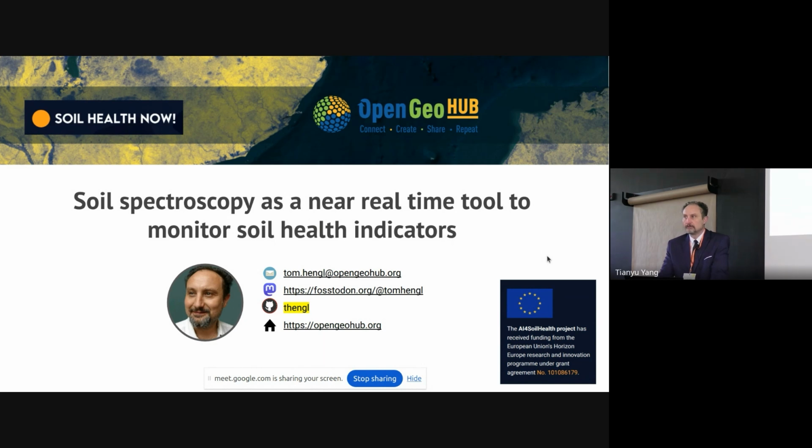So we have a very interesting session for you on soil spectroscopy. It's a workshop, so it's not just a lecture. It's going to take about 1 hour. It's really hands-on. I'll open the data and I'll be fitting some models, and maybe things are not going to work. I did it on my workstation yesterday, but my laptop can run out of RAM or something. But I can show you all the results.